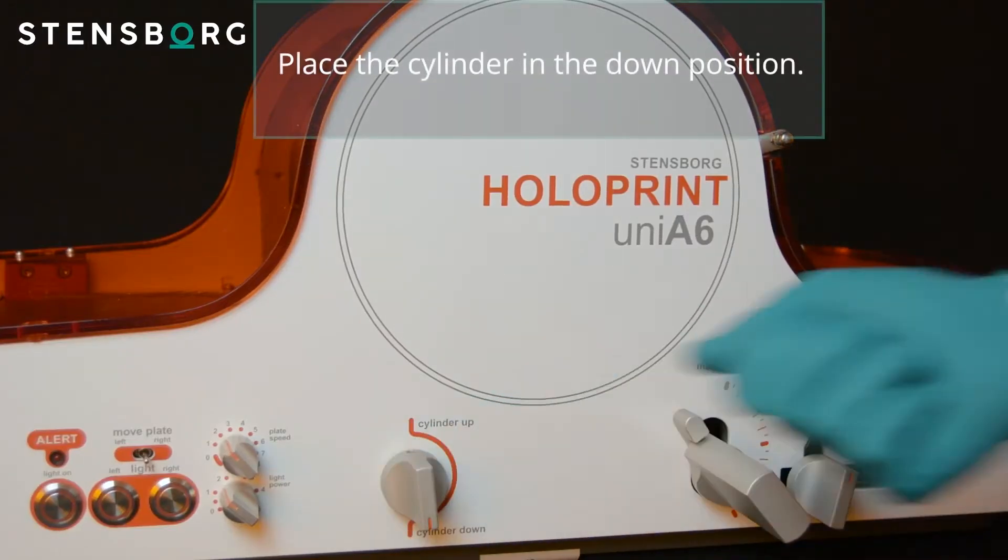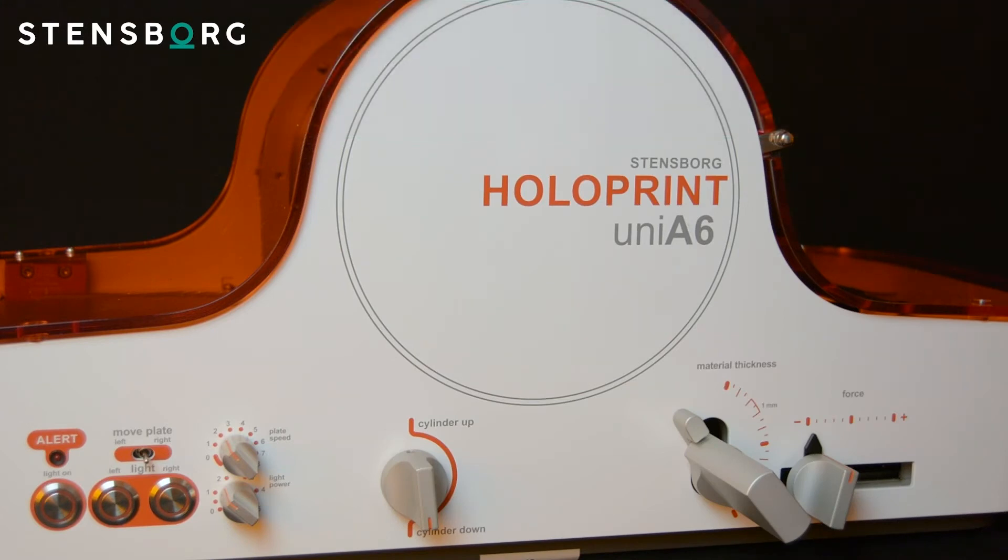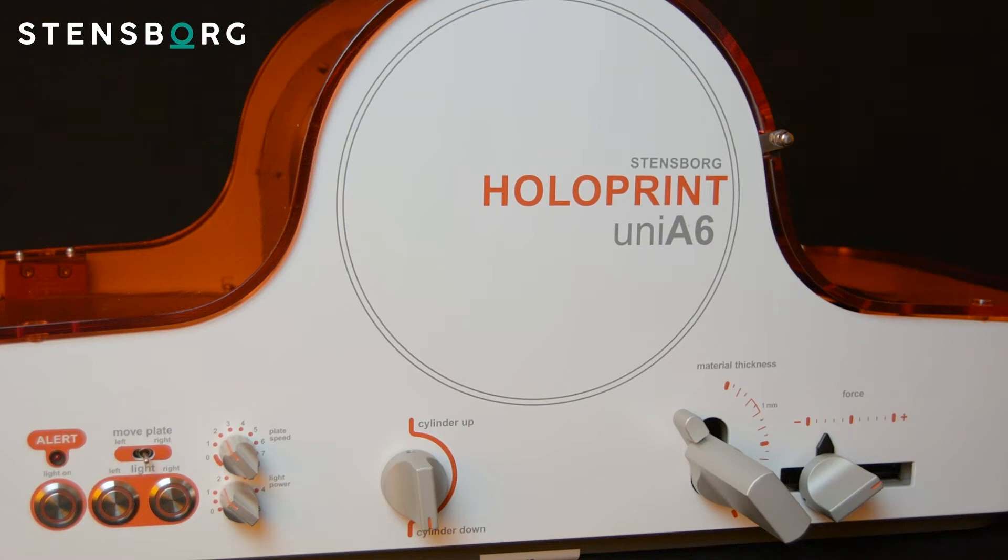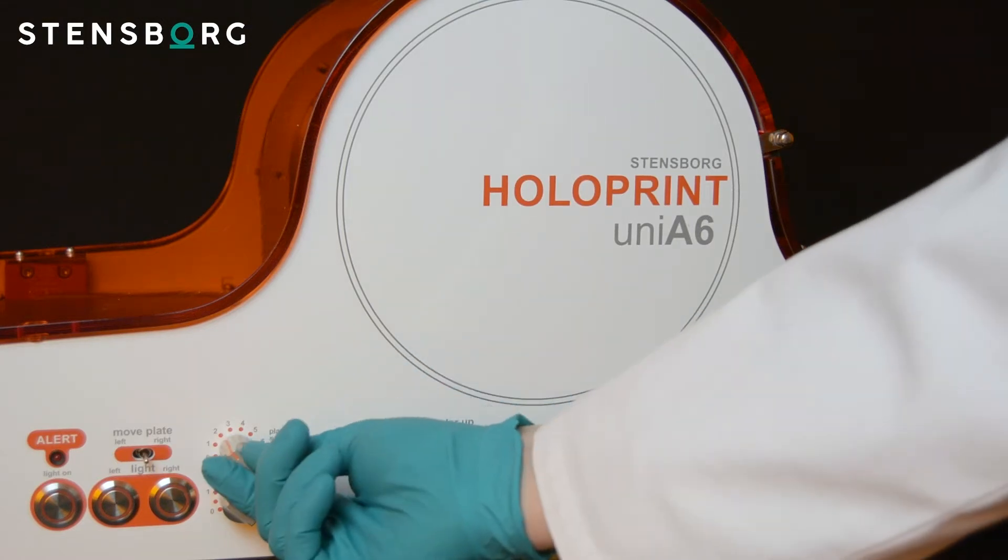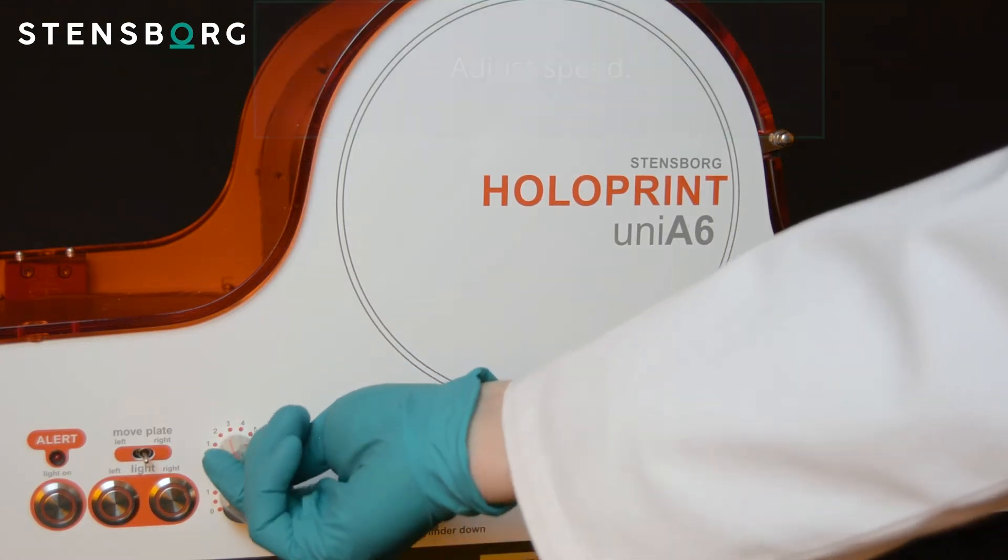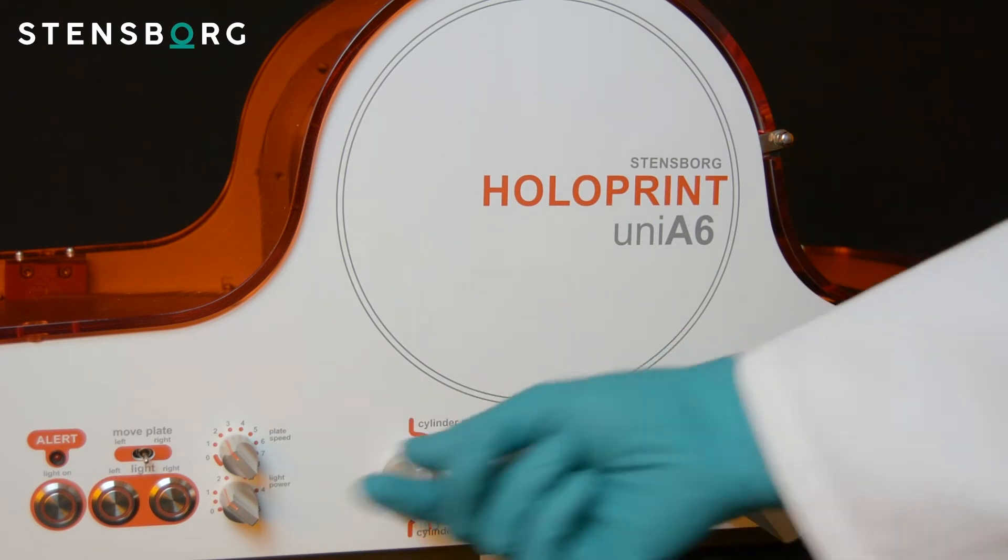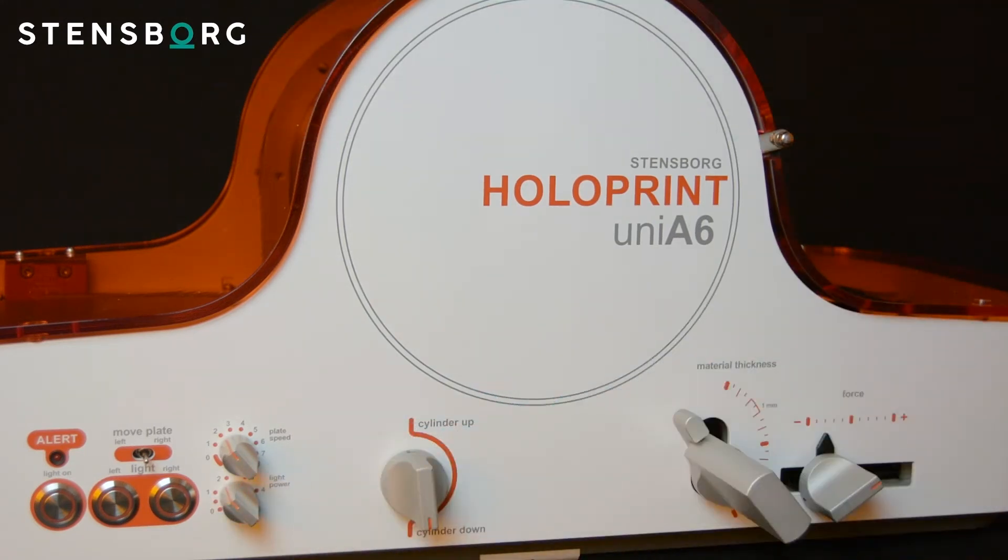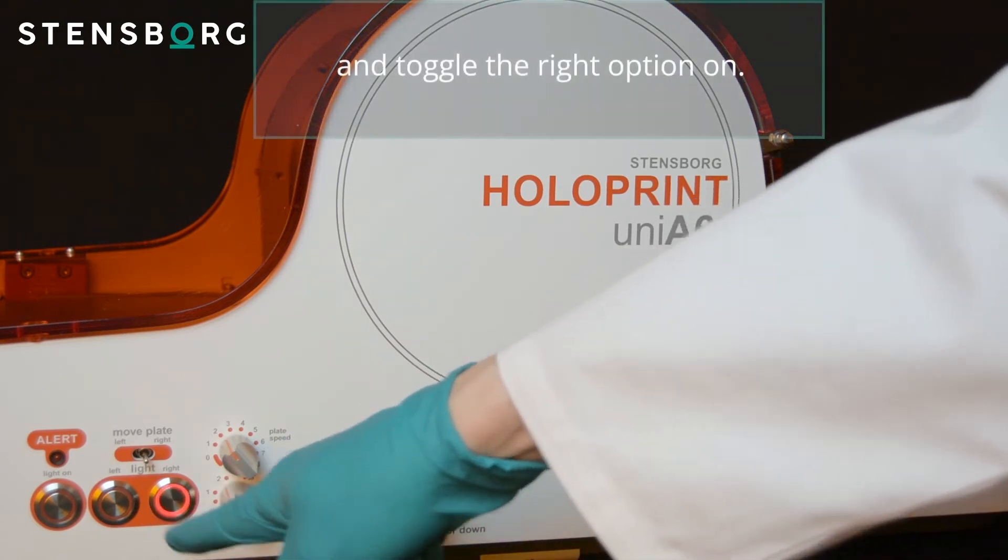Place the cylinder in the down position. Apply force. Adjust speed. Adjust the light power. And toggle the right option on.